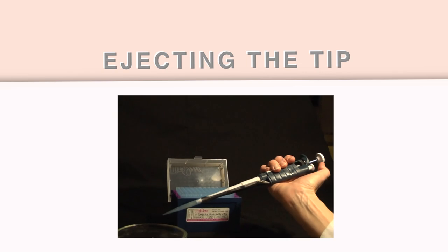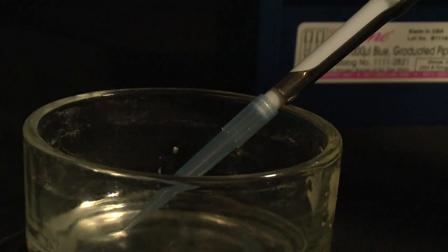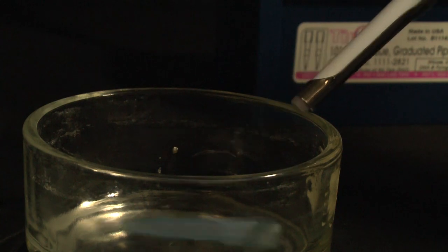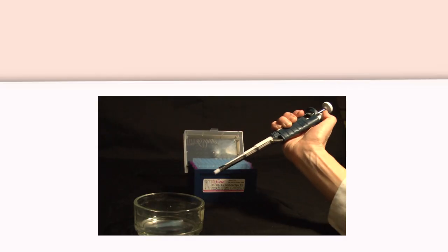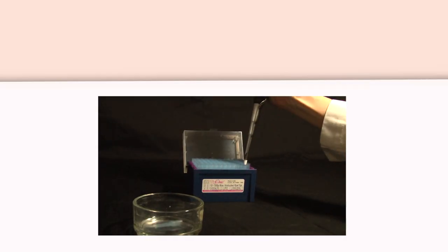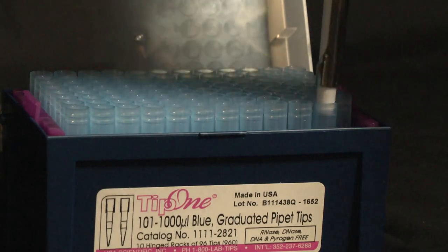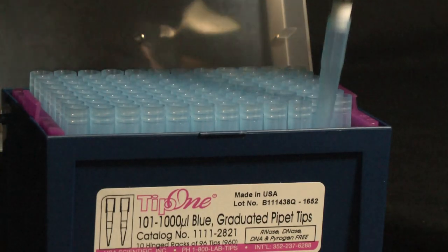To eject the tip, press the tip ejector button that sits next to the plunger. Use a new tip for each new volume dispensing. It prevents cross-contamination of cultures and reagents.